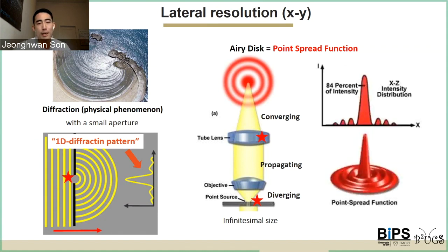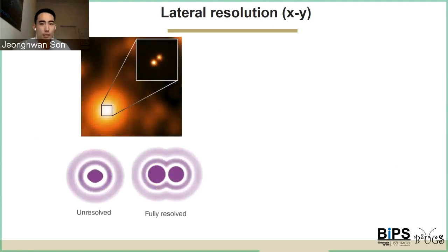When projecting it in 1D, this point spread function shows a sinusoidal pattern. Okay, we go over the case for a single source here. What about 2 sources? When 2 light sources are close to each other, the microscope cannot differentiate them as 2.